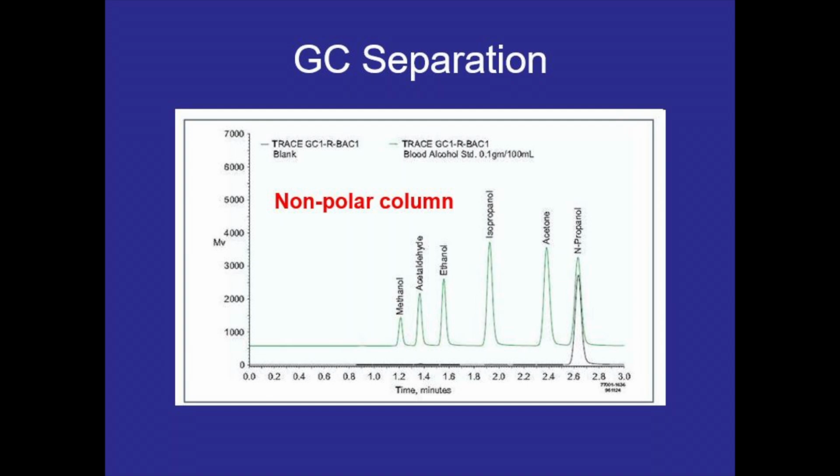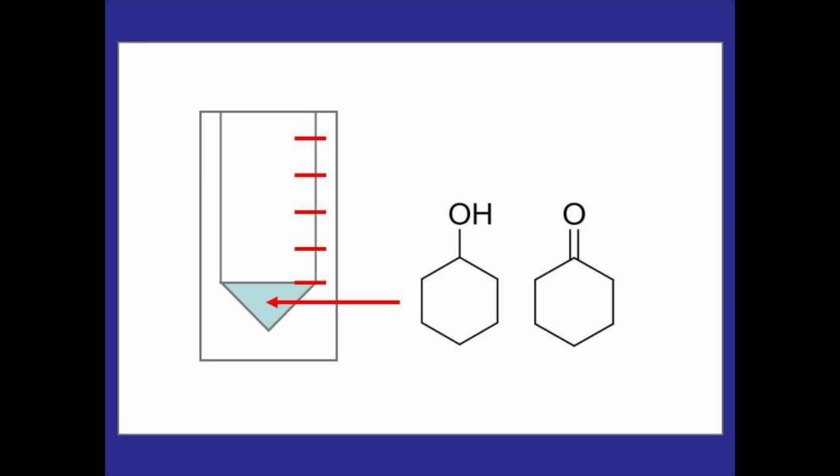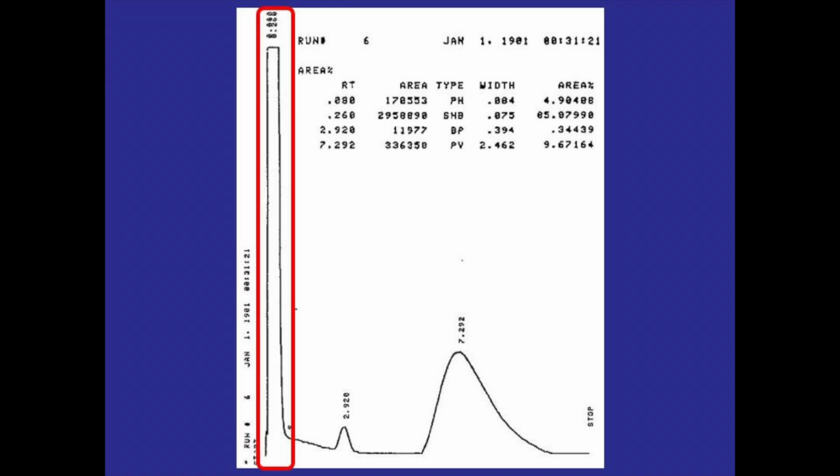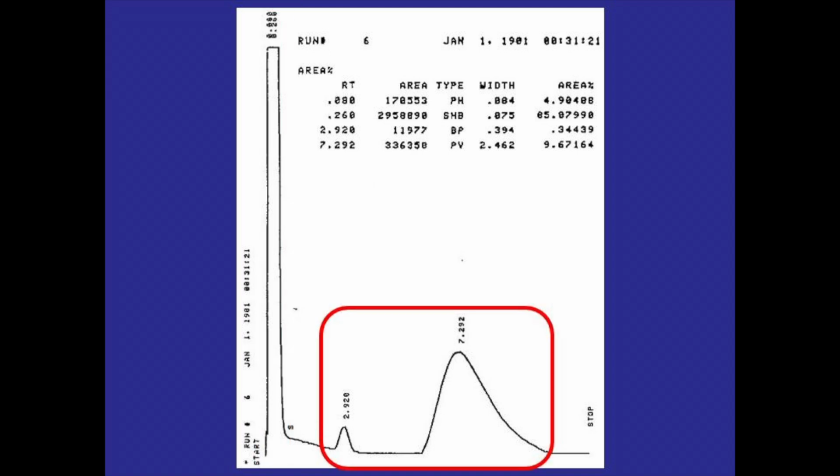Now let's talk about how we would correct the percent yield using this as an example. Let's say that we did evaporate all of the methylene chloride, so unreacted cyclohexanone would be the only thing contaminating the product. And let's say that we calculated a percent yield of 56%. This sample was run through a chromatograph, and this is the printout that was given for that sample. The first tall peak would be for the carrier gas, so we don't really care about that, but the remaining peaks would be for the two compounds in the sample.